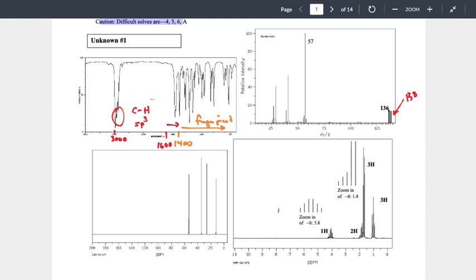If it is something that you find interesting, the textbook goes into some of the details behind our fragmentations. We'll address some aspects of it within the lecture theory, but as far as the lab theory, we pretty much ignore the explosion pattern. We don't look at those pieces. But we do turn and look at our molecular weight, and we'll look at this 138 thing, which takes us to the next thing in the worksheet.